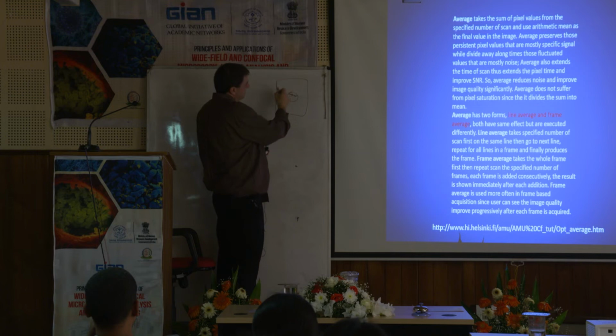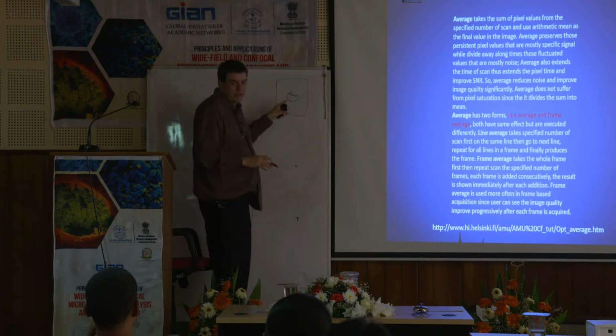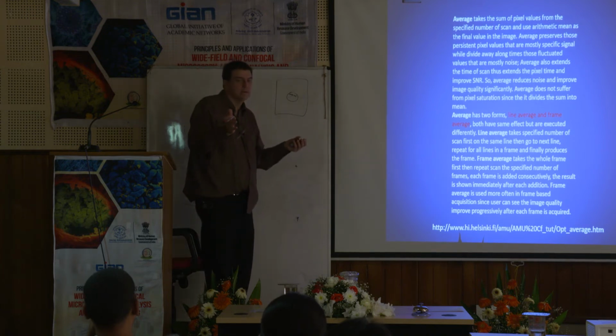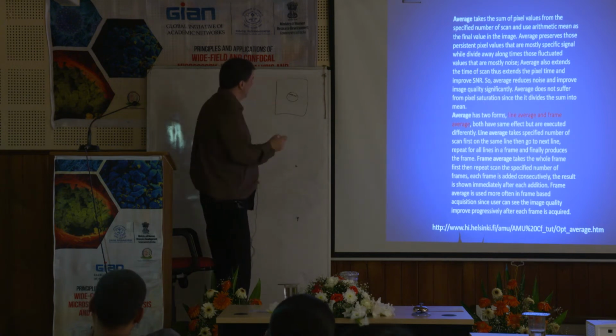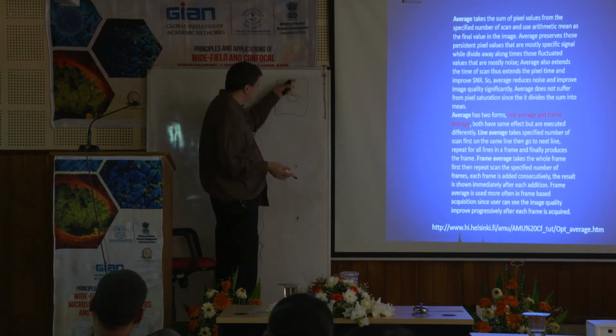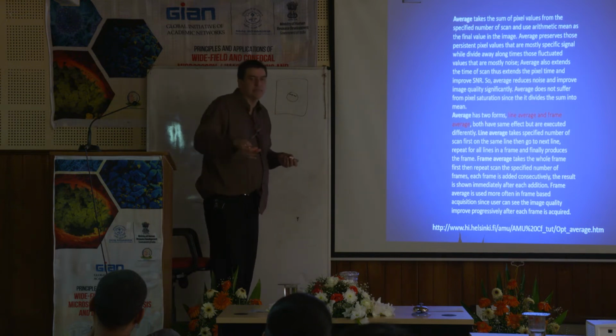So if I came through this 3 different times and I see this dot here, and I come through the next time, but I don't see that dot, and I come through the next time, and I don't see that dot, well, that dot's probably noise. It was there, but then it's gone, okay? Does that make sense? So I'm taking 3 pictures. I see this one dot in all 3 pictures. Well, it's probably a real dot. But if I take all 3 pictures and I only see the dot in one of the pictures, chances are it's noise because it's not there every time.